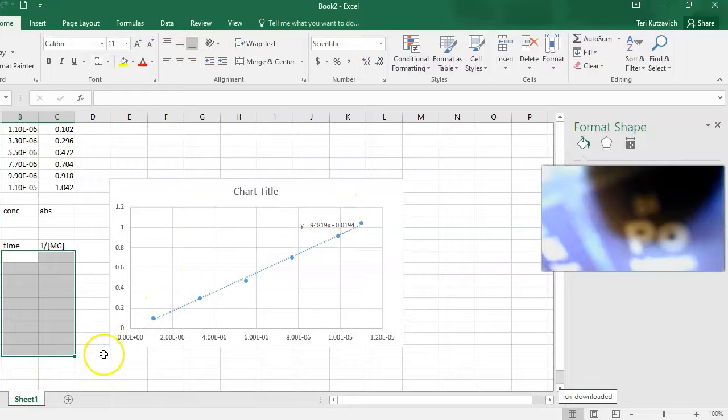Then there is another experiment. It's part 2. You are doing the same thing with another hydroxide concentration. This one, I believe it's 0.05 molar. So you will have everything the same. You will have the same data table with different numbers. You will do these same graphs with different numbers, obviously.